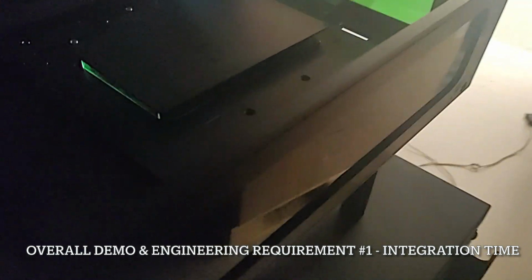Alright, so we're going to go ahead and do another full run through, full measurement of another chemical. Right now the probe is sitting underneath right here over at cell A1. So let's go ahead and switch chemicals. We'll move over to cell A4 that has ammonium nitrate in it. Okay, so we're right over it. Let's go ahead and put the safety cover on. And we'll go ahead and enable the laser. Alright, laser's definitely on.